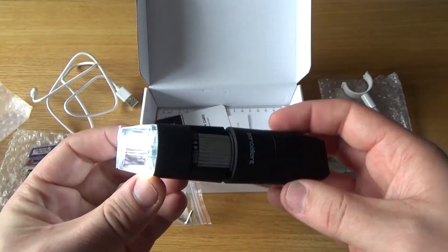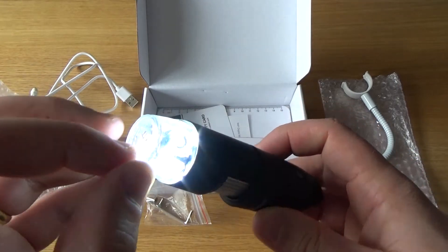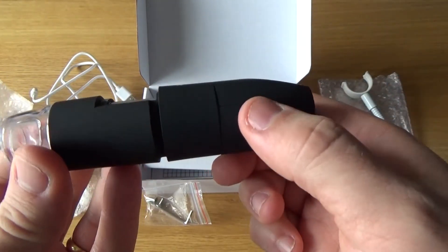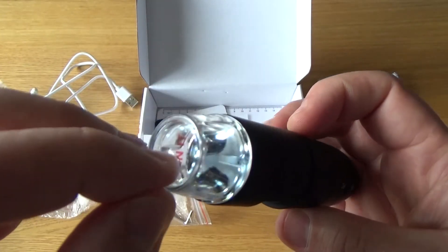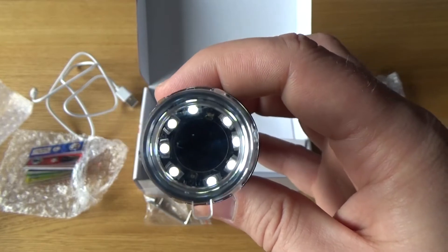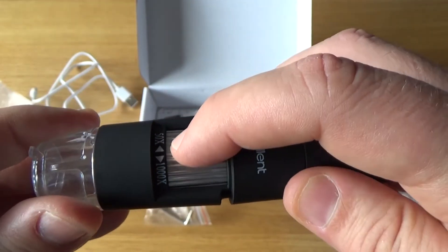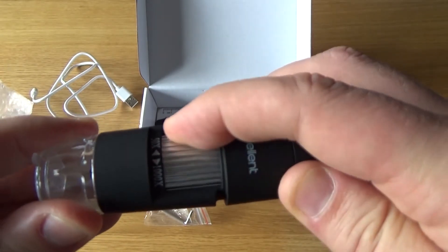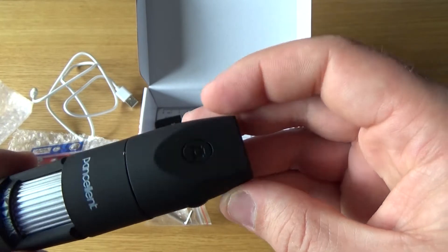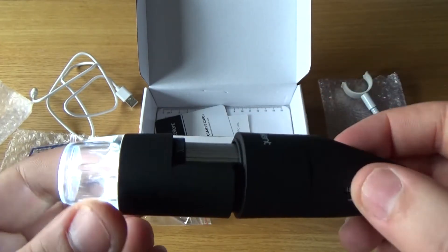That is the microscope itself. The light switches on immediately, so it came charged. The wheel you see in the front gives you the sharpness control. The top button switches it on and off, and another button only controls the light. It comes with a little seal in the front — peeling it off, you can see the eight LEDs inside. It also has a lid in front with a little latch on the side that you can take off, which opens the whole lens and allows you to get really close to objects. The wheel on the side spins to give you zoom and adjust sharpness based on how far away you are from an object.